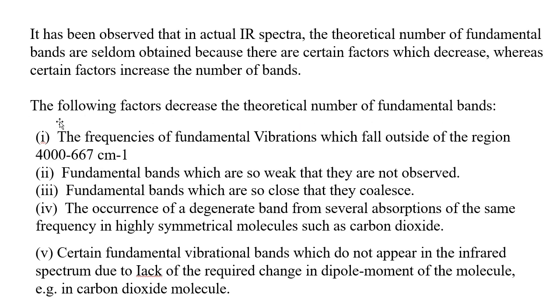For example, frequencies of fundamental vibrations which fall outside the region, that is the 4000 to 667 centimeter inverse IR region. Sometimes the fundamental vibrations fall outside this region.